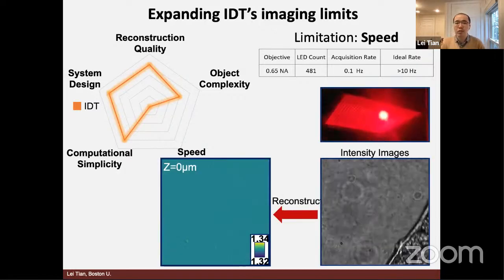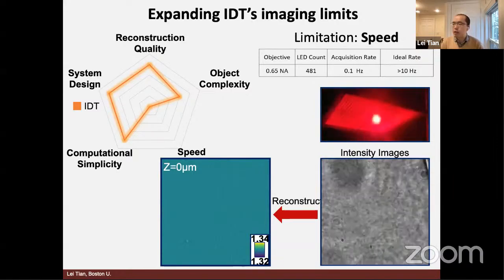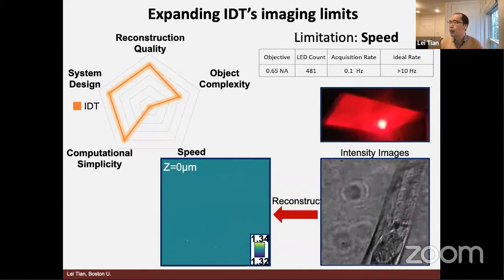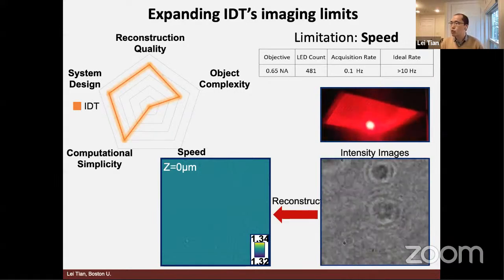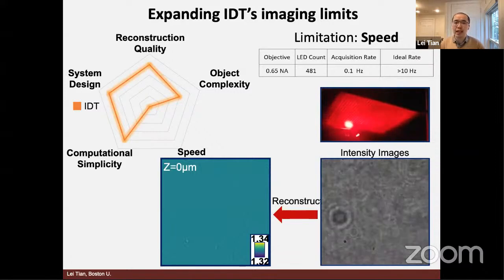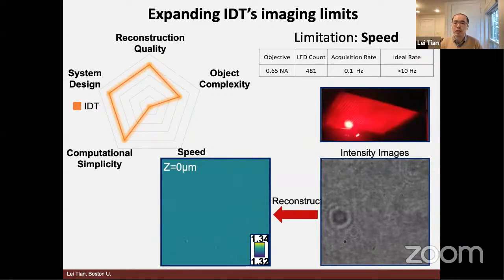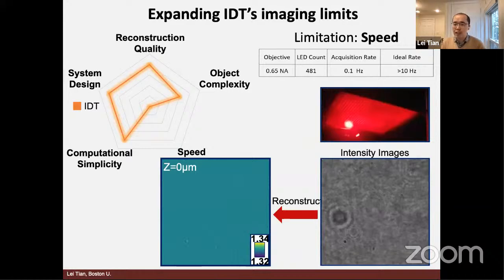When we try to apply this technique for a live sample — in this particular case it's known as C. elegans, a kind of worm that developmental biologists love to study — because the worm is alive, as we scan through the LED one at a time, within a single dataset the worm already moved quite a bit. The motion blur becomes so severe that we will not be able to correctly reconstruct the 3D information. We need to devise different methods to achieve dynamic live sample imaging with minimum motion artifacts. At the rule of thumb, for this kind of biological process, you need to achieve a data rate of about 10 Hz — in other words, capture each frame at 0.1 seconds.